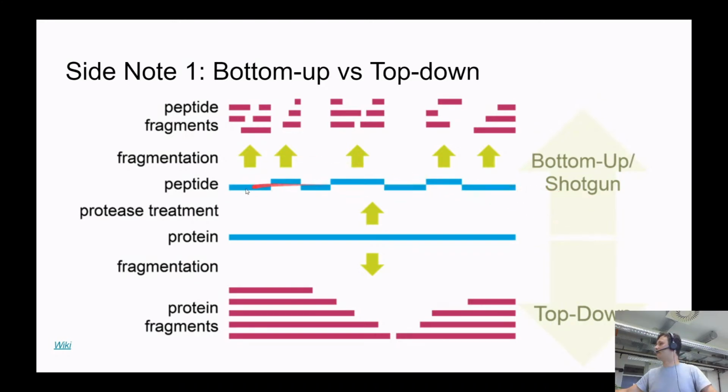So it's exactly the same principle used in the case of proteomics and shotgun proteomics. We're taking proteins and using proteases, let's say trypsin, we are digesting these proteins into peptides. And next, we're just taking these peptides and analyzing them all together. So as a result, instead of, let's say, 10,000 proteins, we're now analyzing millions of peptides. And yeah, that's what shotgun proteomics is.